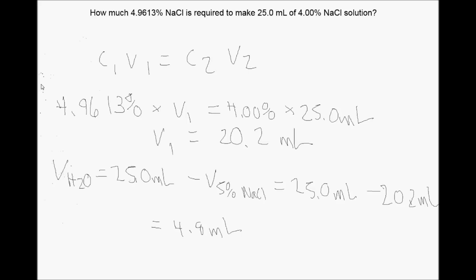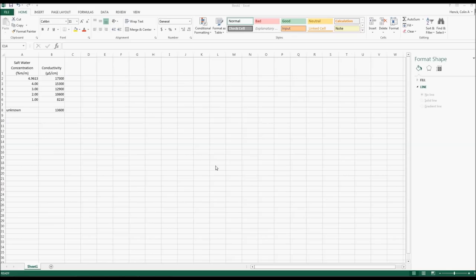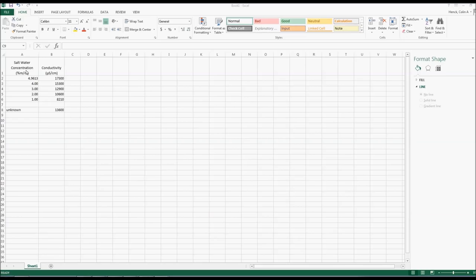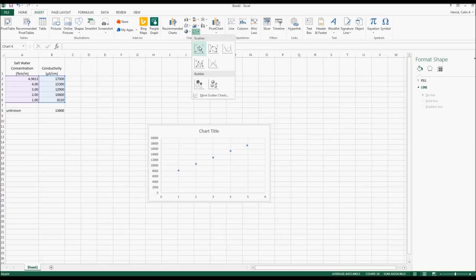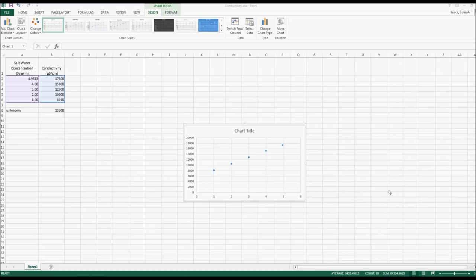Once the conductivity of all solutions has been measured, data can be imported into Excel to make the calibration curve. In Excel, saltwater concentrations in mass percent go in column A and conductivities in microsiemens per centimeter in column B. Add the unknown conductivity in row 8. To make the XY scatter, select the known concentration and conductivity data, click Insert, select XY Scatter, and choose the top-left option. Then select Quick Layout and choose the top-left option, and delete the Series 1 label.